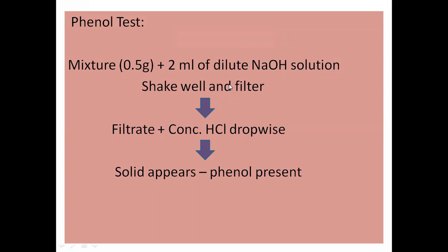So in the filtrate you add the concentrated HCl. Then if the solid appears, it means that phenol is present. So in this also, now you add the dilute NaOH.